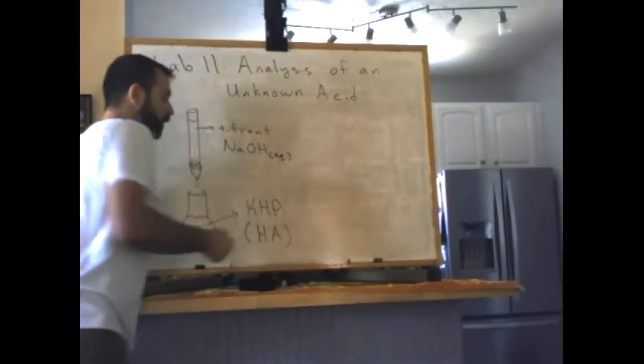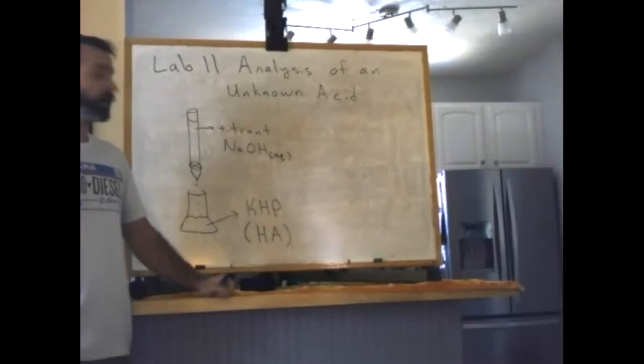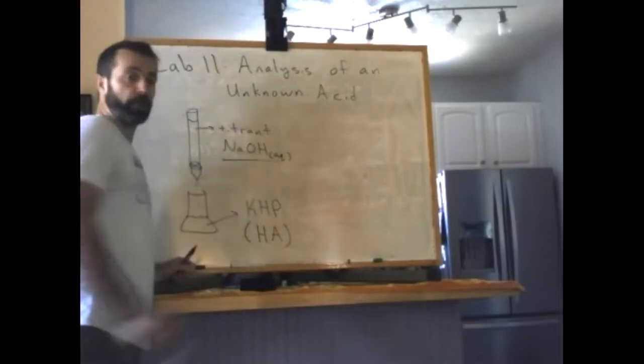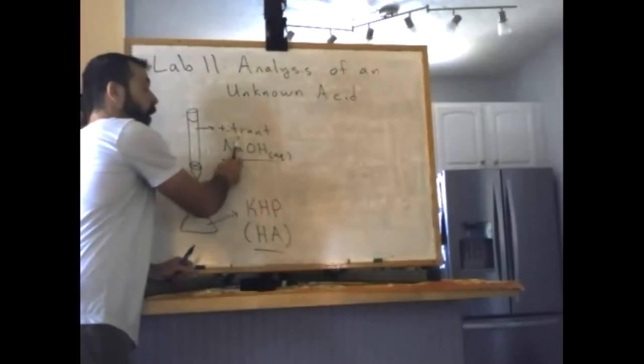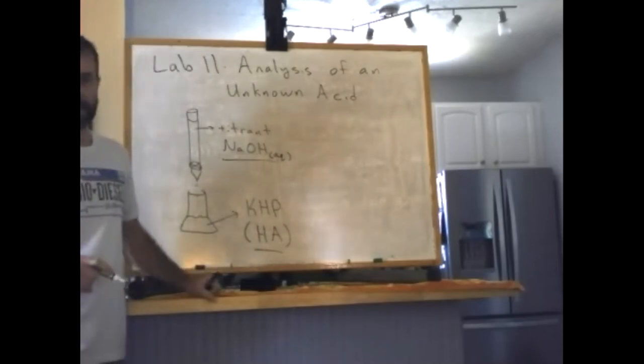As you know, all weak monoprotic acids have a proton that they can donate in water. All right, so what we're going to be studying is this reaction between a strong base, sodium hydroxide, and a weak acid, KHP.